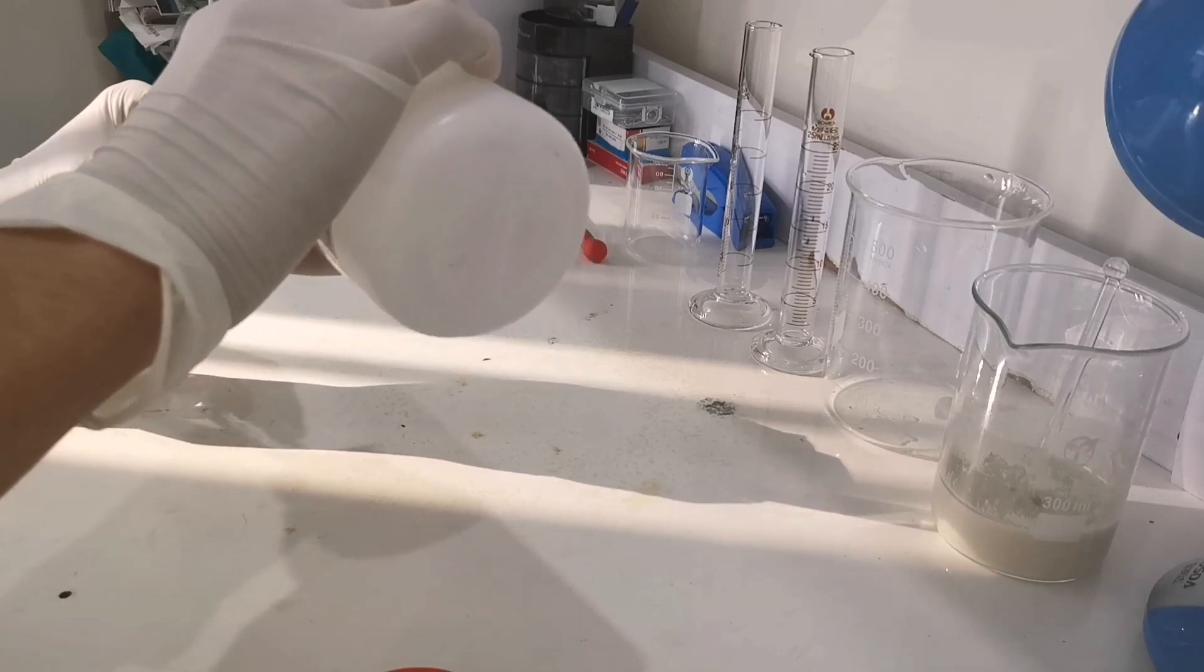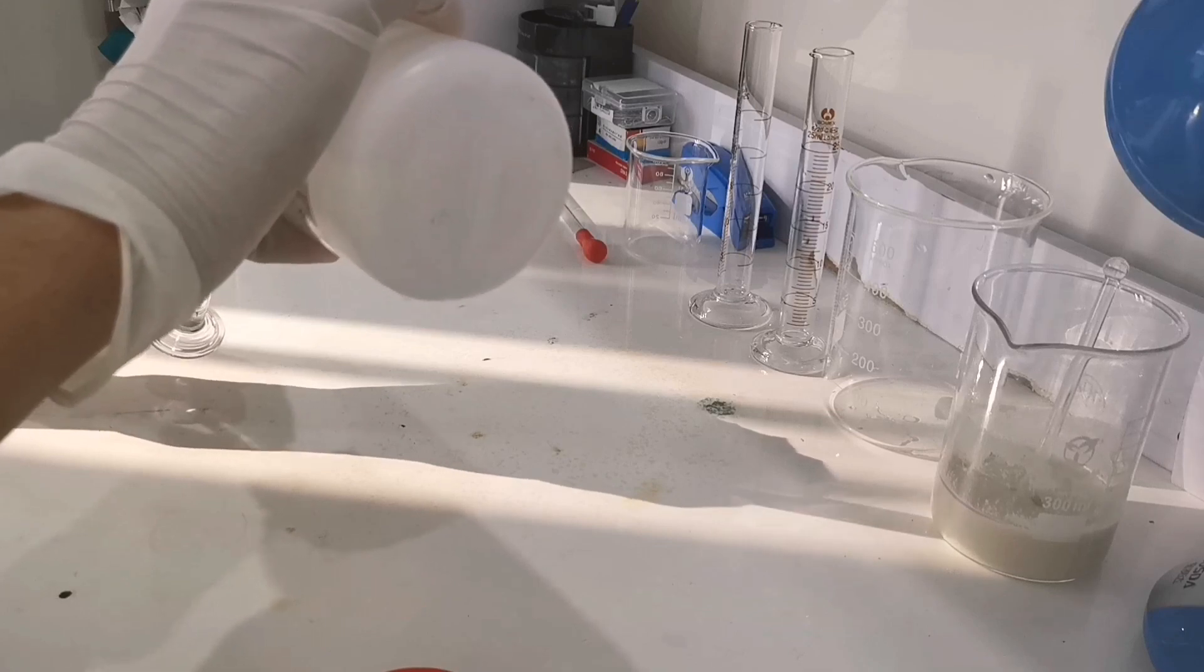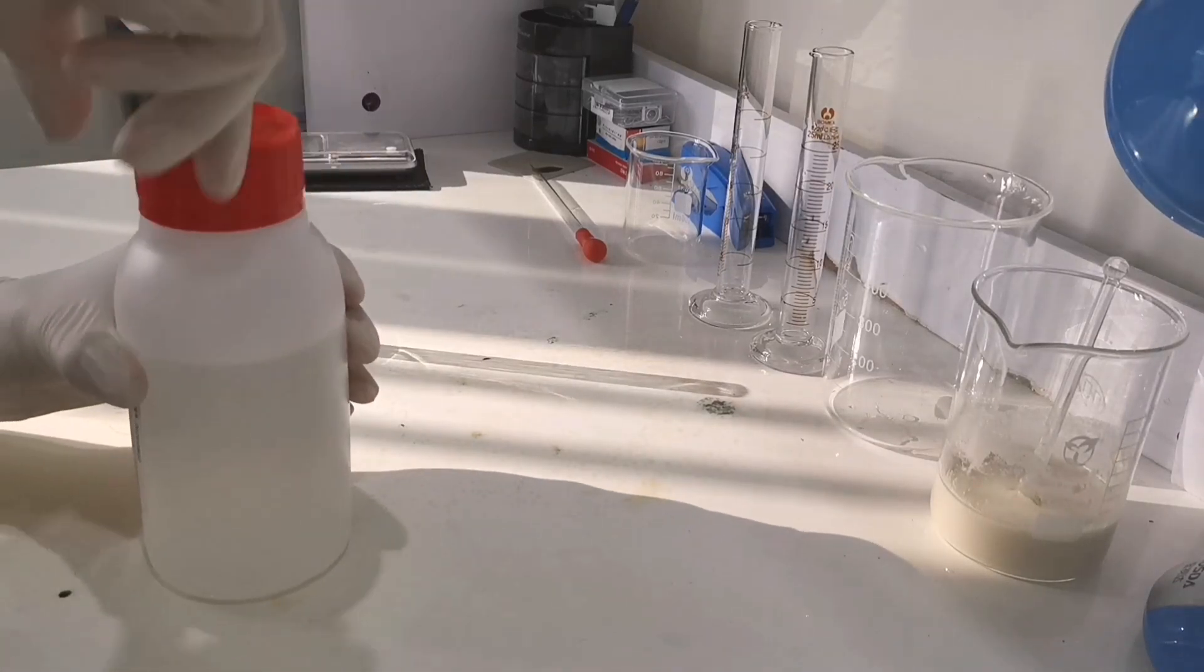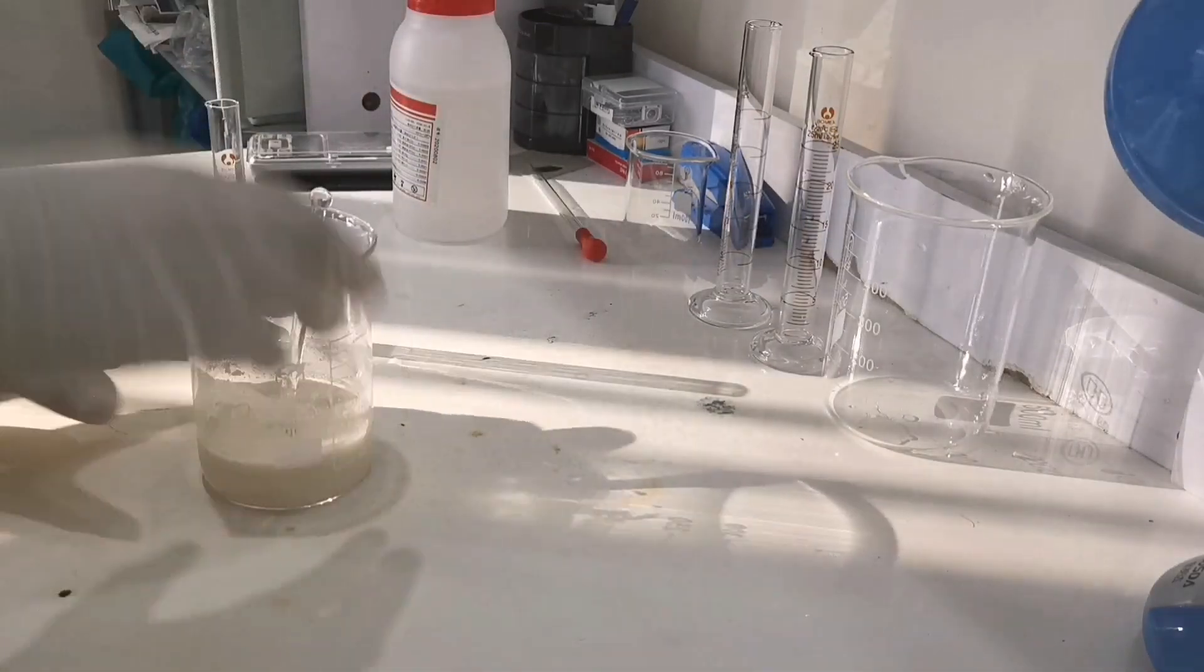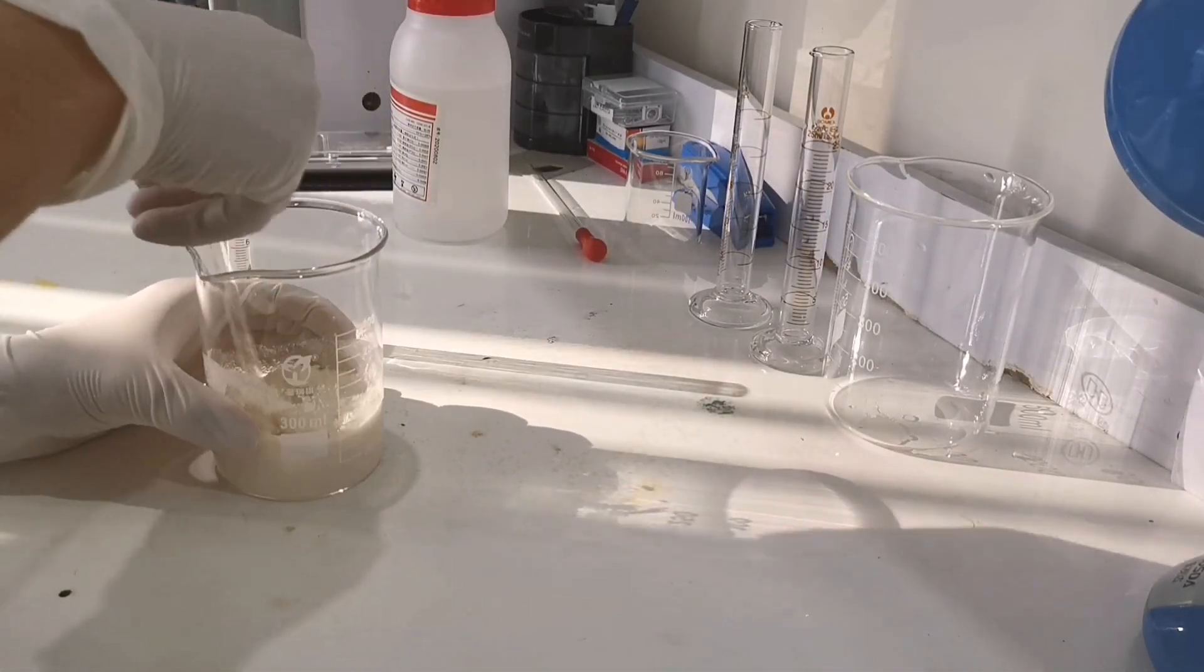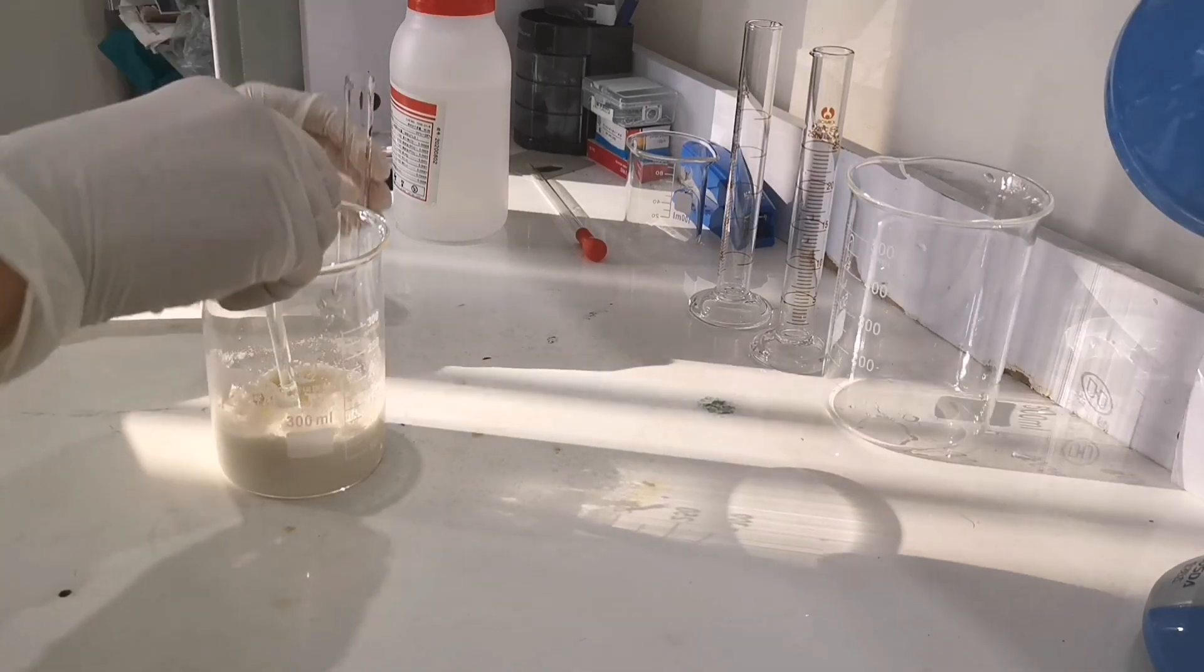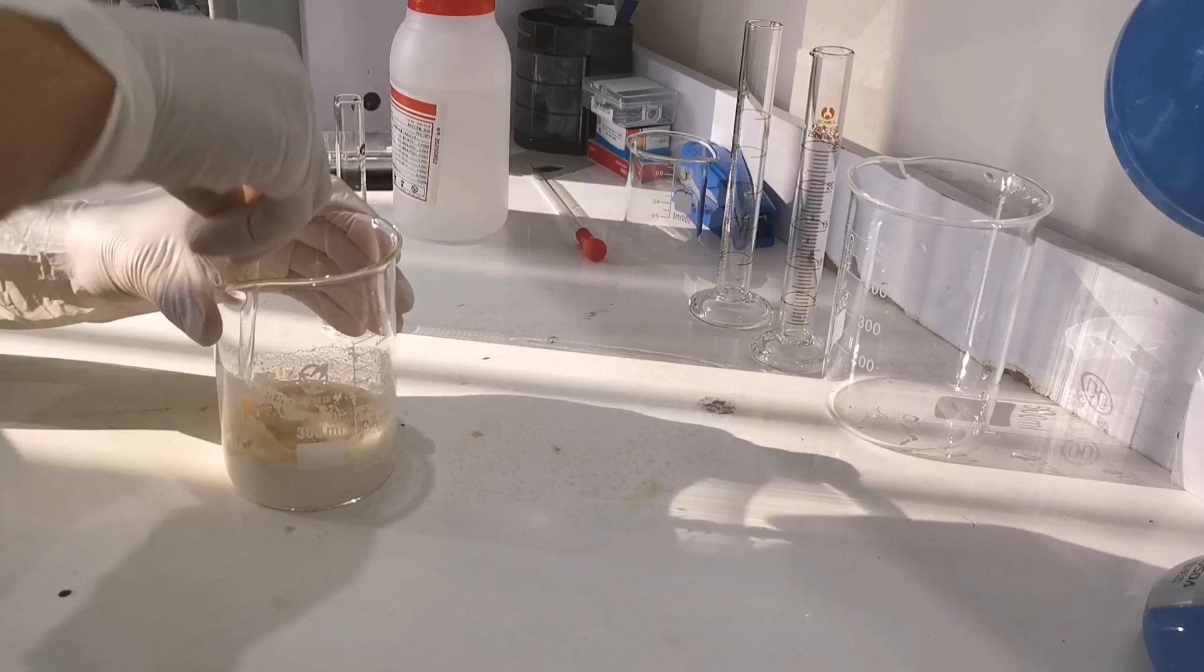Now we measure out 2.5 mls of 25% ammonia into a measuring cylinder. Closing the bottle of ammonia and now we are ready to add ammonia into the casein. We give casein a bit more stirring and slowly add the ammonia into the beaker. The moment we add the ammonia, it's very important to stir it immediately.